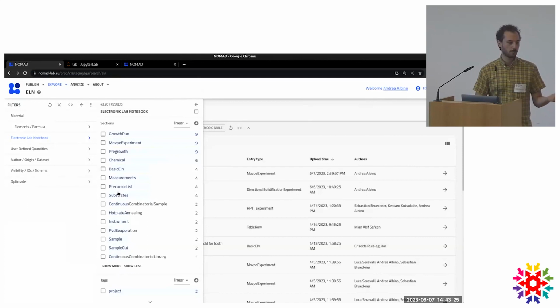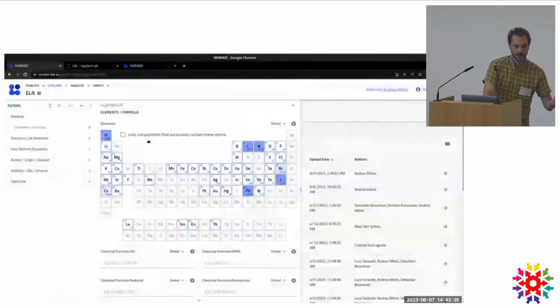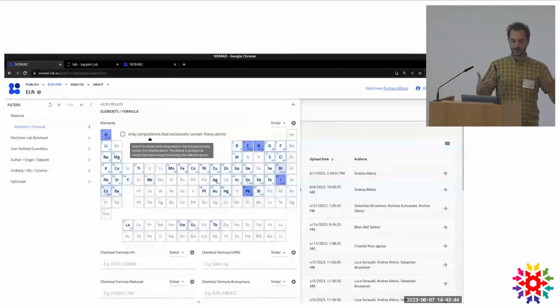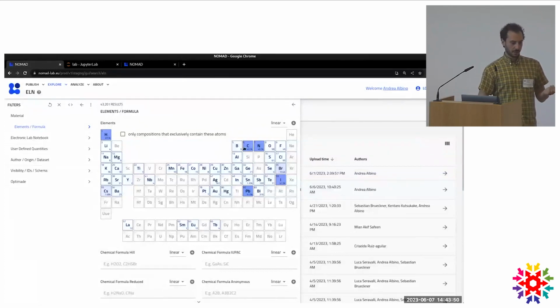So this is already one of the advantages that we can benefit of. Or for example, there are other searchable parameters. Clearly, we are defining this kind of searchable parameters because it's hard to standardize and to find, let's say, an agreement in the community on what to put as a standard parameter that one should fill. Here we find also some composition.